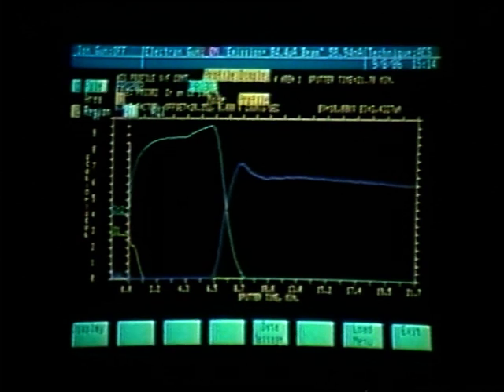This is our 2-point profile. Notice carbon was very strong on the surface and then fell away quite rapidly. We see an interesting oxygen peak. We do not see that peak overlap in the 2-point profile, which we saw in the window profile. That is because we are not differentiating and measuring any background. It is peak minus background. And as long as there is no peak overlap when we select the energy of the peak and the energy of the background, when oxygen is absent, the oxygen peak-to-peak height will go to 0.